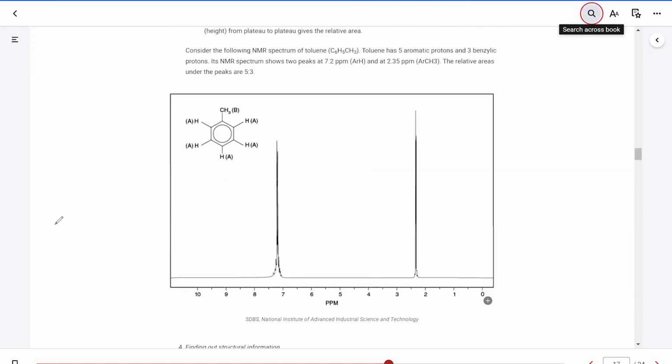Just looking at this as an example and comparing to the table we had, NMR spectroscopy says this compound is aromatic, and there is a methyl group attached to the aromatic. These hydrogens are going to be deshielded by this pi system, and the signal for the benzylic hydrogen would show around 2.5, and that's what we have between 2 and 2.5.